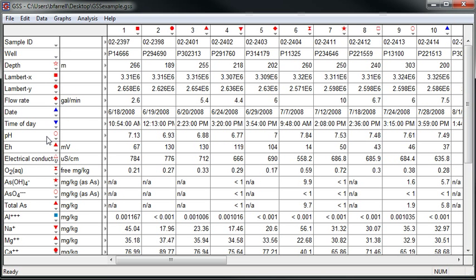To get started, I've opened up a GSS spreadsheet in which I've stored analyses for a number of samples.